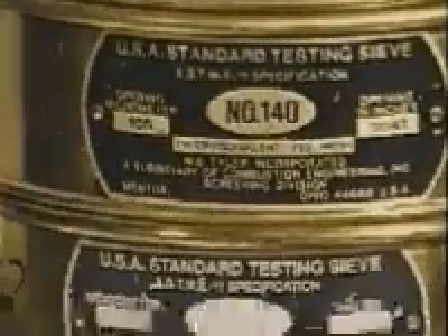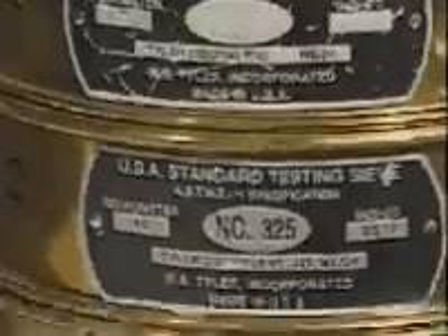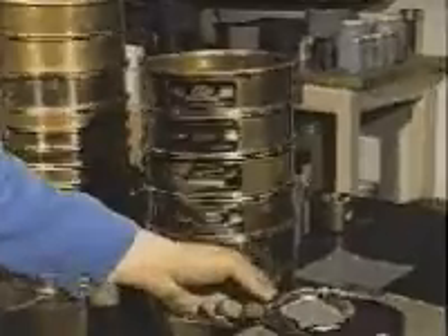The group of sieves selected shall be assembled in consecutive order based on size of openings, with the sieve having the largest opening placed at the top, and the assembly completed by a solid collecting pan placed below the bottom sieve.